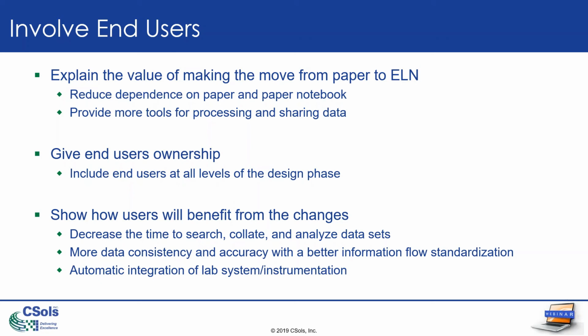Another example you might give them is the automatic integration of lab systems and instruments. You can give precise examples: if you are doing biological assays, for instance, you can get your raw data straight from the instrument, pushed to the ELN, and all the rest of the calculations and processing is done by the system.